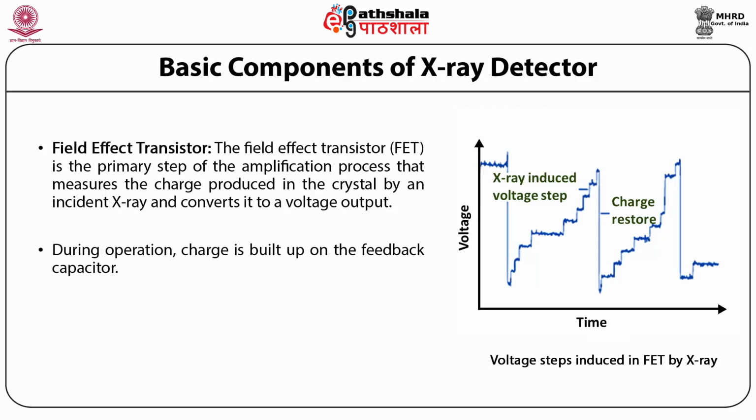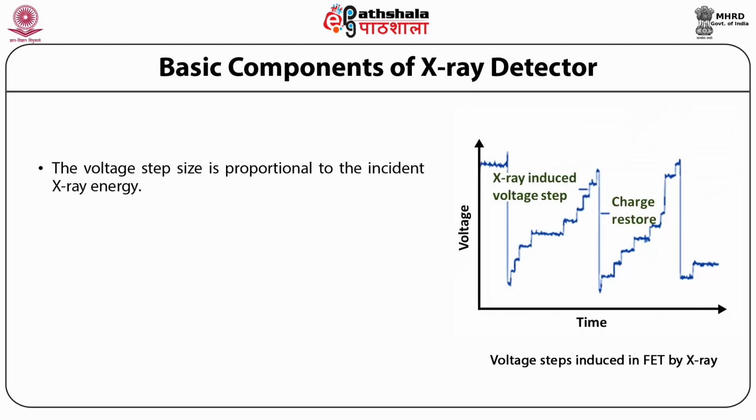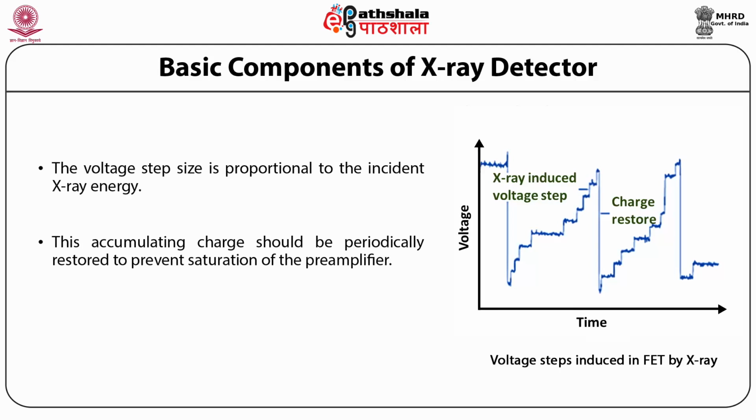During operation, charge is built up on the feedback capacitor. The sharp steps on the voltage build-up, as shown in figure 8, are due to the charge created by each X-ray event. The voltage step size is proportional to the incident X-ray energy. This accumulating charge should be periodically restored to prevent saturation of the preamplifier.